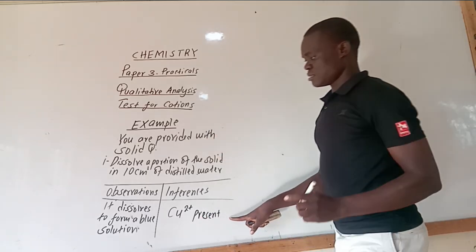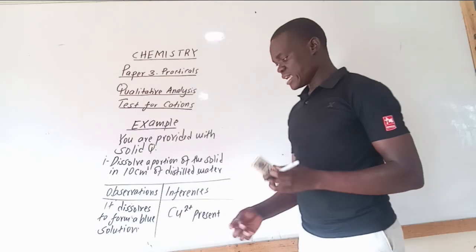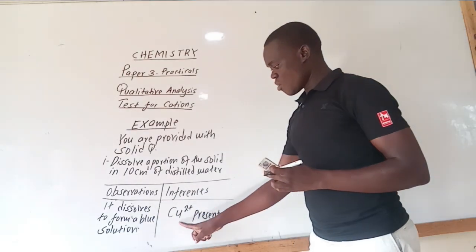You see, it dissolves to form a blue solution, and the inference is copper 2 ion present.